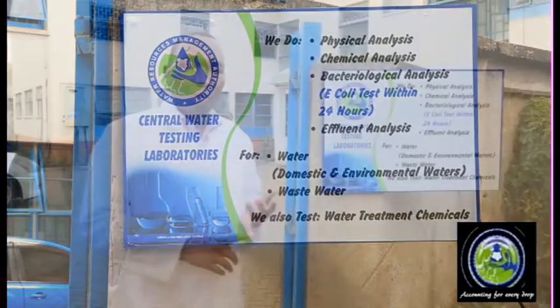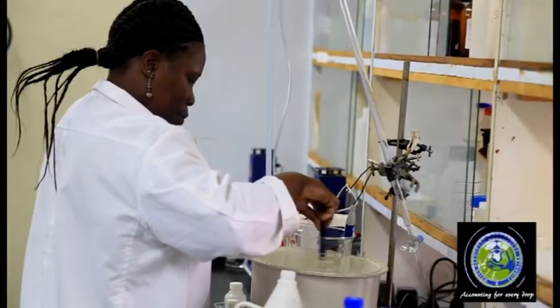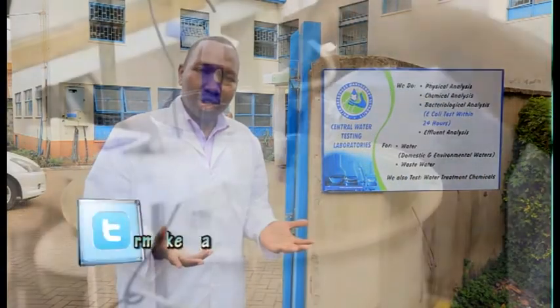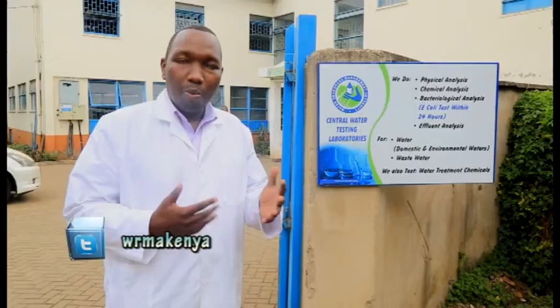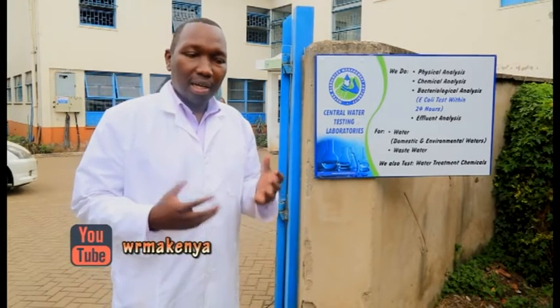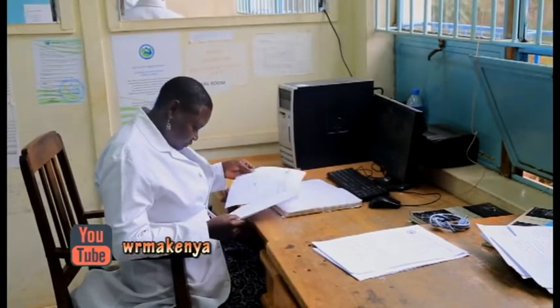Effluent testing for wastewater and for drinking water. For drinking water, there are 2 types of tests that we do. There are physical-chemical tests and there are biological tests. We normally do 2 types of tests. Wastewater test, that is water that is discharged by industries, schools, and water companies. So that water we normally measure a few parameters to ensure that they are of the correct quality for discharge into the environment.